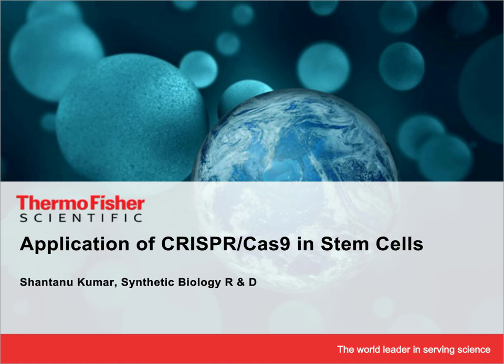Hello, everyone. My name is Shantanu Kumar, and I am an R&D scientist in the Department of Synthetic Biology at Thermo Fisher Scientific. Today, I will be sharing some of our recent work to demonstrate highly efficient genome editing in a stem cell using CRISPR-Cas9. In the next slide, I will talk about stem cell engineering.